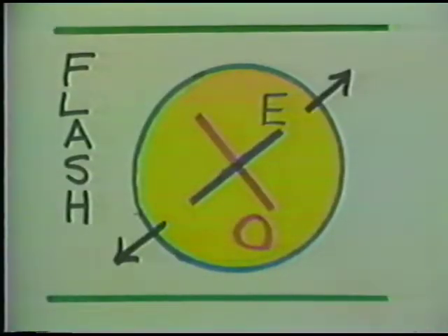Well, what if you have a flash figure? This is another common kind of figure, and we've already demonstrated the flash figure and the way that the isogyres leave the field very suddenly, and when they leave the field suddenly, they leave in the direction of the E ray.